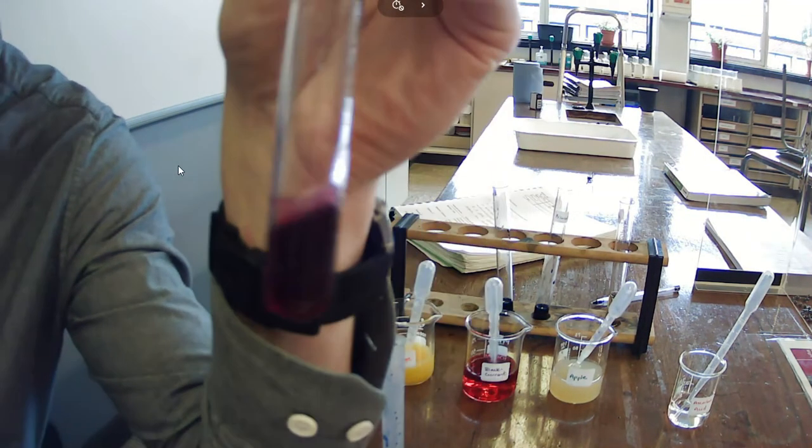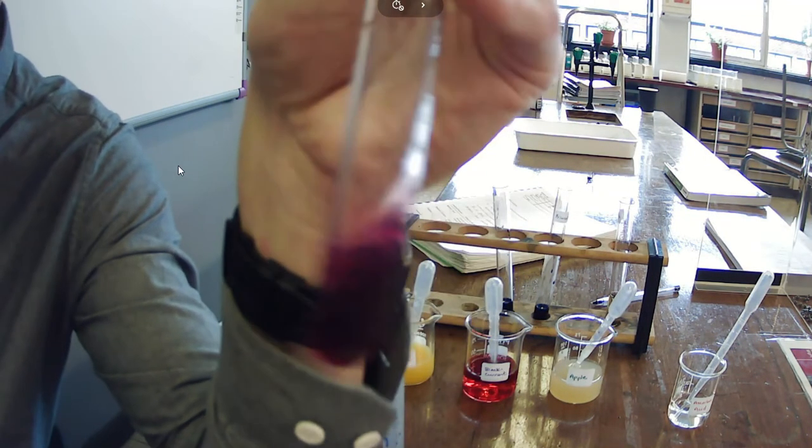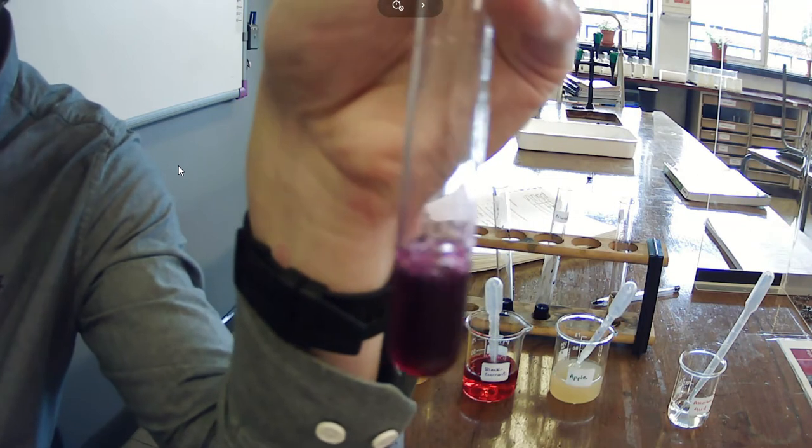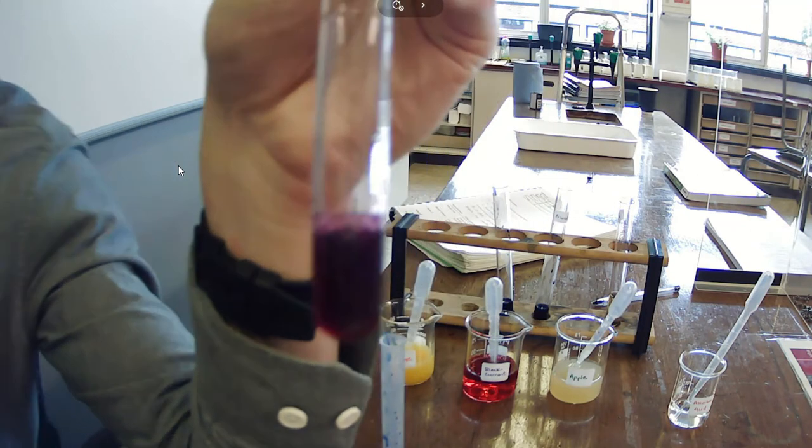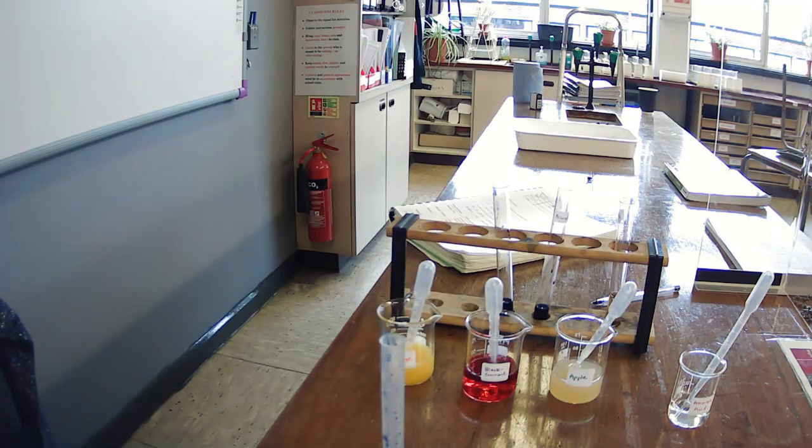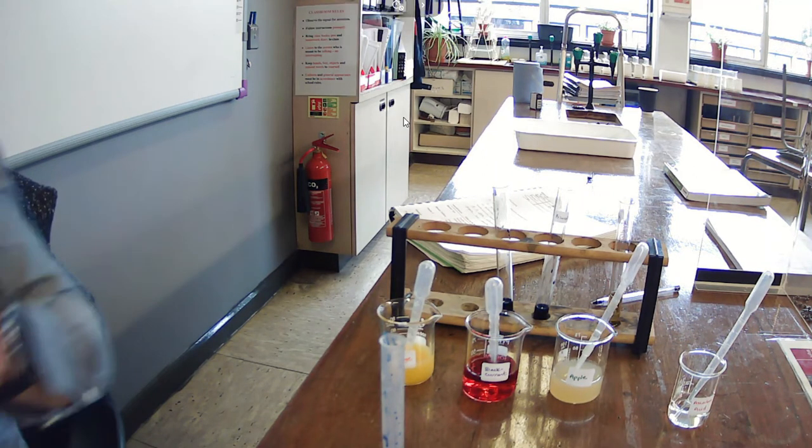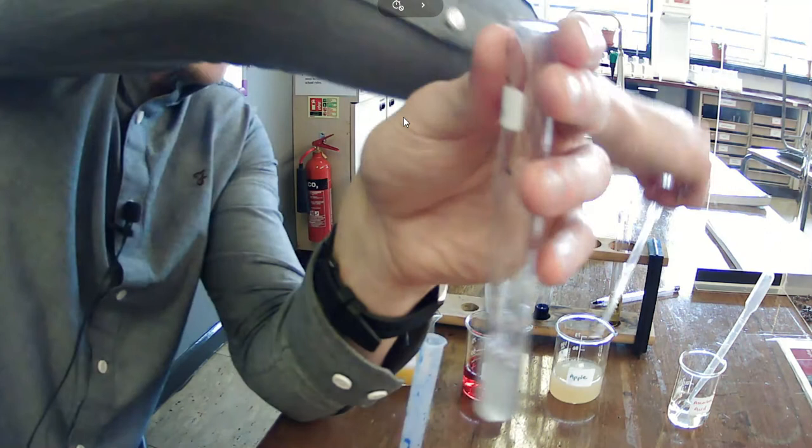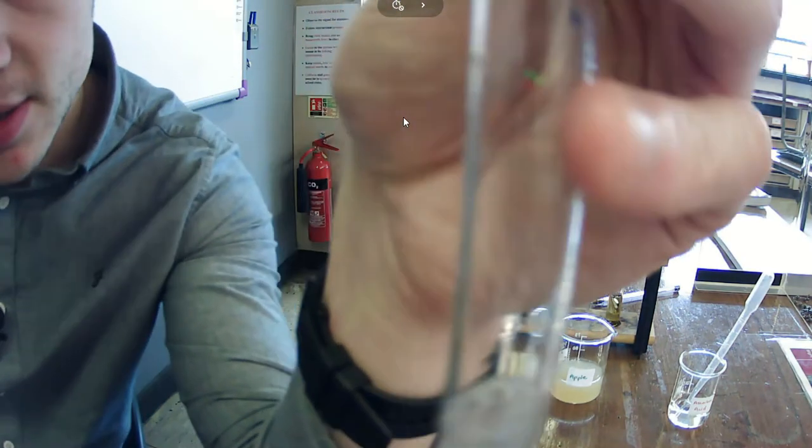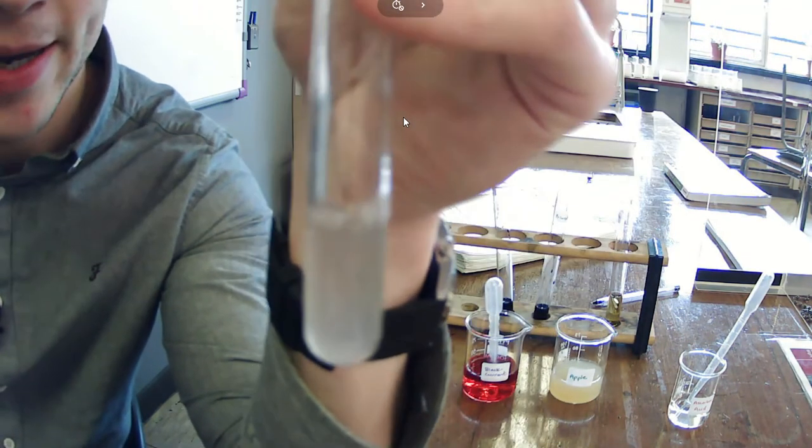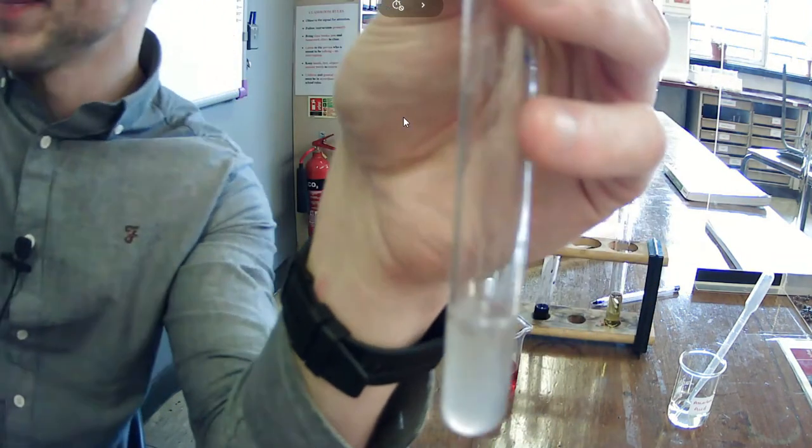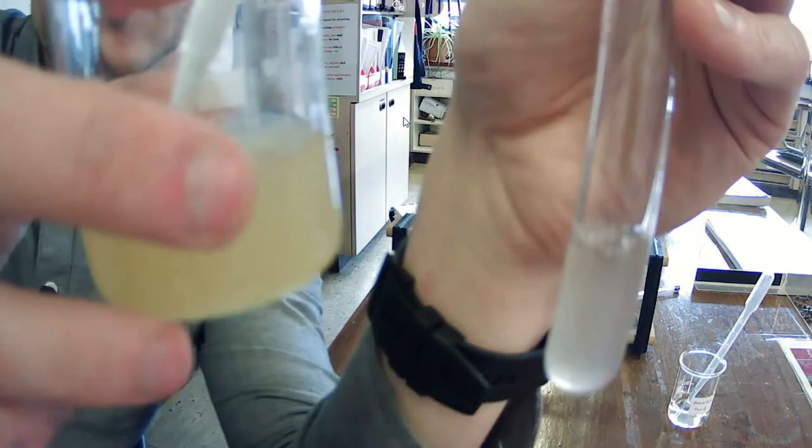So here we have apple juice after 20 drops. So unlike the ascorbic acid, it is not clear yet. And I've just added 40 drops to this and it has just gone now the color of apple juice.